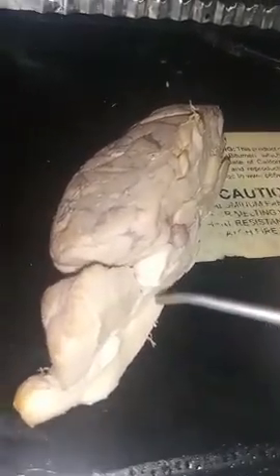This is where the spinal cord is located, and then back to the cerebellum. And then the fourth ventricle is located under the cerebellum. And then the cerebral aqueduct is located down in here, which is the channel connecting the third and fourth ventricles, and it contains the cerebrospinal fluid. The superior colliculus is right here.